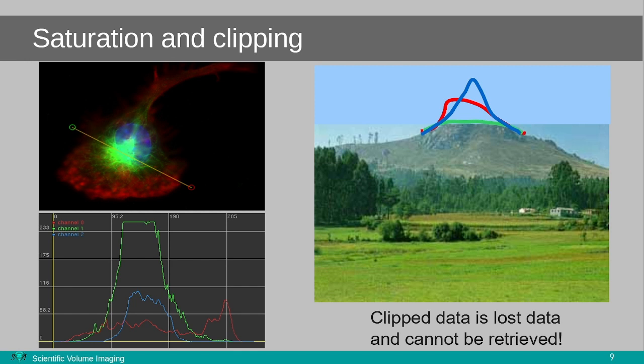Sometimes the signal of a fluorophore can look very dim and you don't see it that well. A solution is to increase the gain of your detector. That way signals get boosted. But this will also increase the noise in your image and comes with a real chance of clipping your images by oversaturating the detector if during the acquisition you move to a brighter part of the 3D volume.